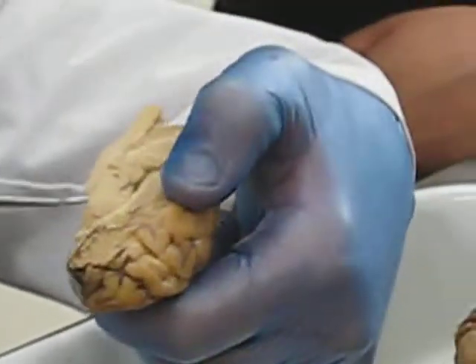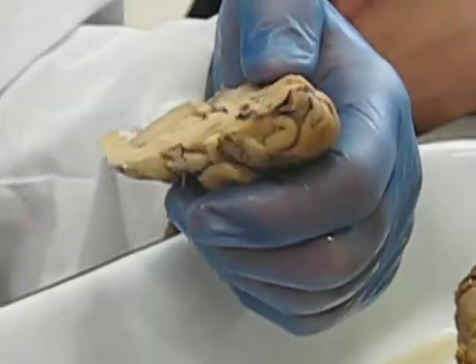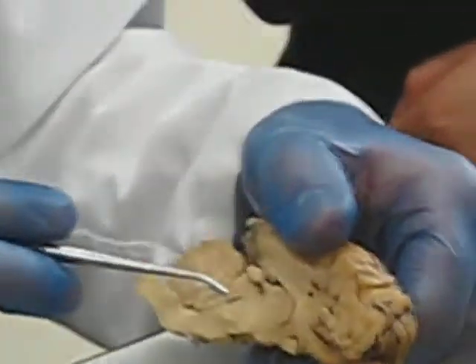It's connected to the telencephalon. This is all telencephalon. Is that the colliculi right below it? Superior colliculi is right there. Yeah, so it's superior and touching. Inferior is right there. If you take a look here, you can see the pineal gland right up above. See it there? Oh, I see. This can't be the first time you've seen this.